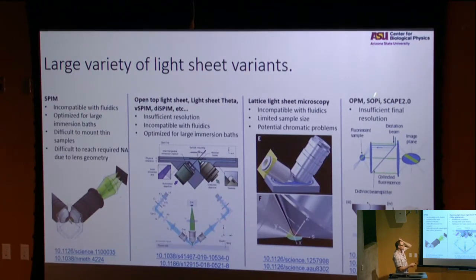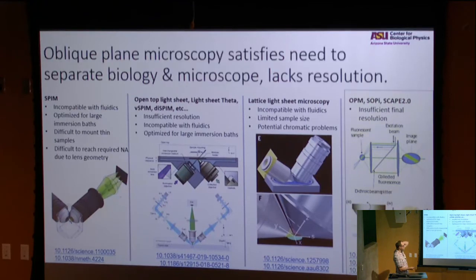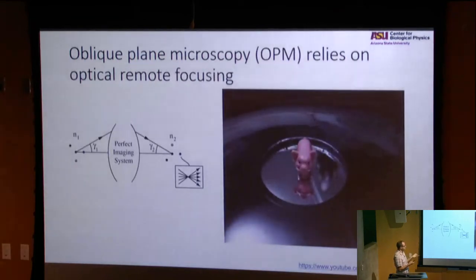Chris Dunsby introduced oblique plane microscopy. Elizabeth Hillman introduced SCAPE. The idea here is we're going to play with the way the microscope works a little bit to only have one objective interfacing. I want to take a second and describe that, because this is what we've been working on. Again, the goal here is to get better 3D imaging than SIM can give.